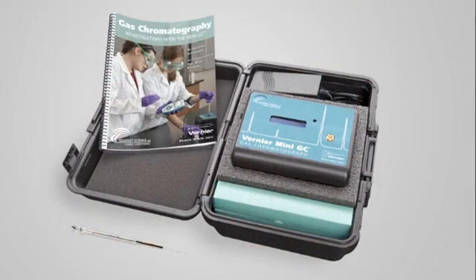It connects through any of those devices through a USB cable and the Mini-GC comes in this plastic carrying case with all the cables you need, including that USB cable, and also with a lab manual with five labs that we've already written for you.